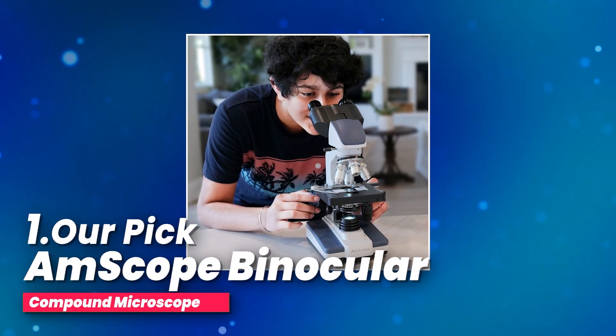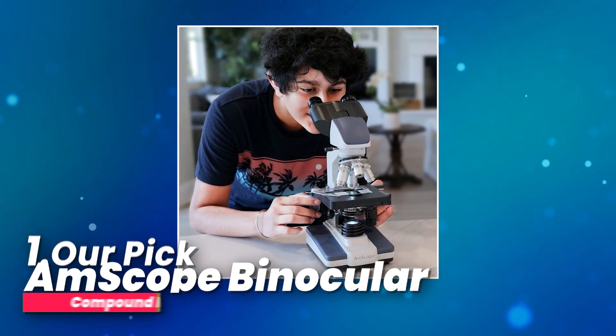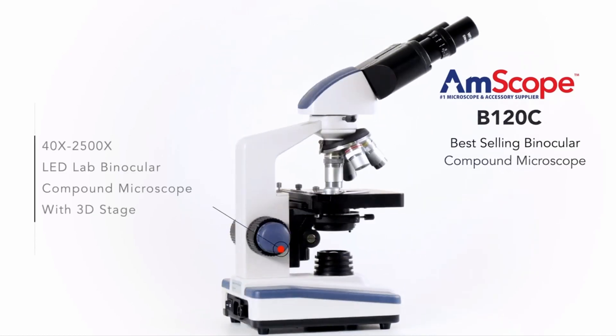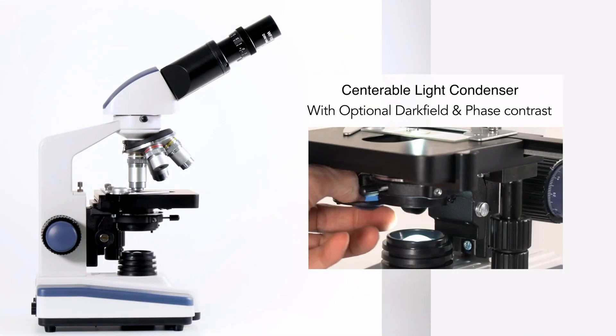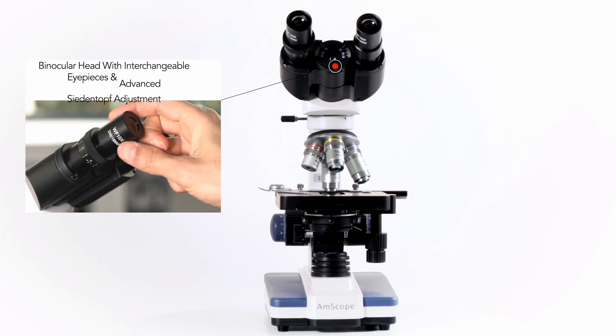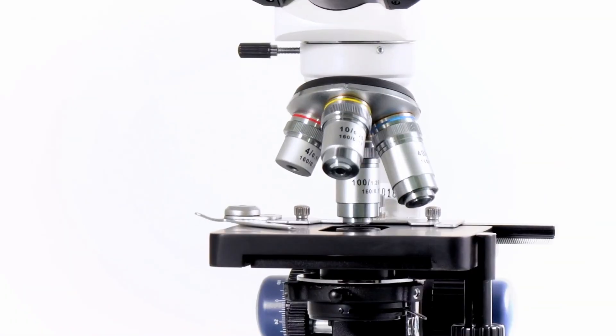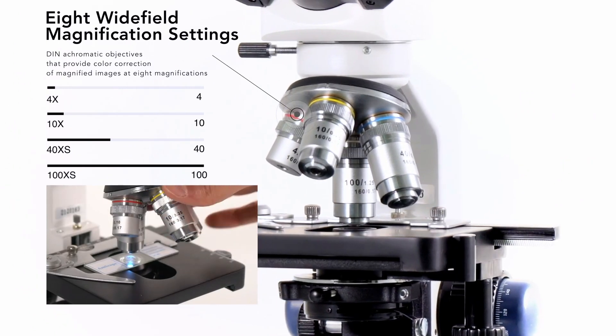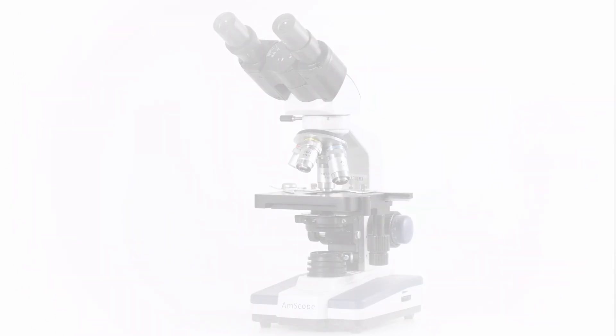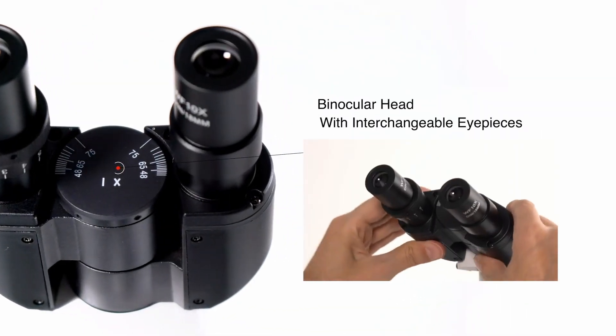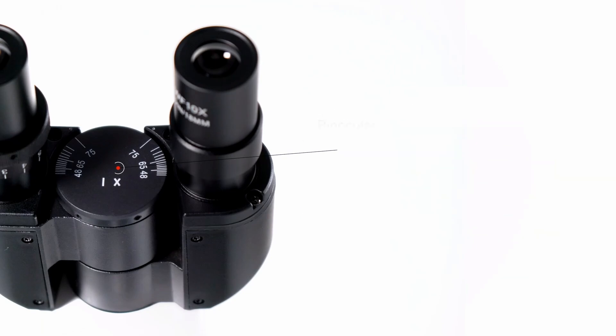Number one, our pick: Amscope Binocular Compound Microscope. Ready to dive into the world of microscopy? A compound microscope is your gateway to high magnification, perfect for exploring biological specimens and enhancing educational experiences. Let's start with the Sedentoff binocular head, a standout feature that takes your viewing experience to the next level. It comes equipped with pairs of 10x and 25x wide-field eyepieces, allowing you to choose the perfect magnification for your observations.